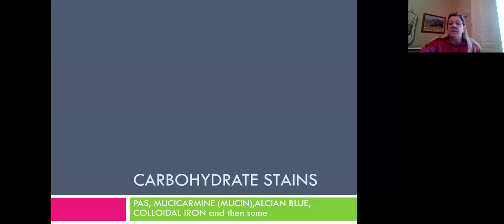So we need to talk about carbohydrate and amyloid stains. This is a very, very long lecture, so of course, feel free to take a break whenever you need to. What we're going to do is discuss the carbohydrate stains as well as the amyloid stains. We're going to go over steps, functions, and results and show you some pictures of what they should look like once completed, as well as give you some tricks of the trade along the way. So let's get started.